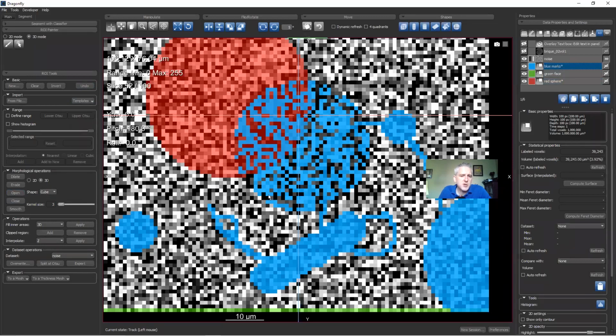However, if you take this data set that's quite holey, the blue data set, and I do an opening, it's going to erode by 1. And so a lot of these pixels are going to disappear, and then it's going to dilate by 1. So let's see an opening. All of these pixels that were touching a white pixel disappeared, and there was nothing left to grow back. And so you can see the effect.